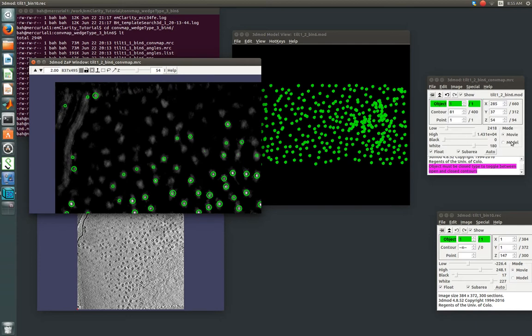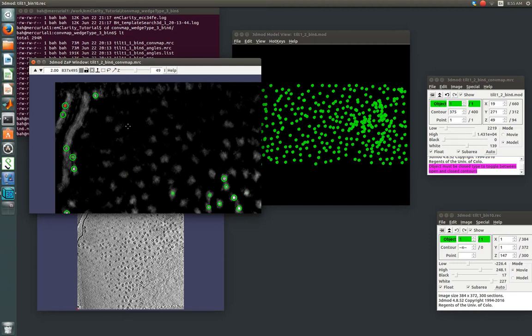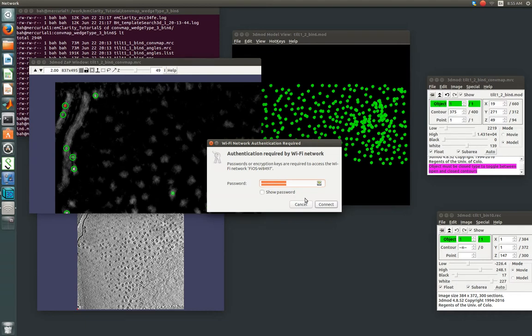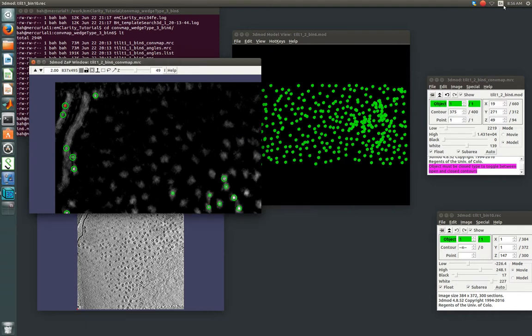So again, you can toggle that with the M key or over on the iMod window. In model view, if you select a given point, you see it moved there. And it's just going to this slice in Z that that piece is centered on.